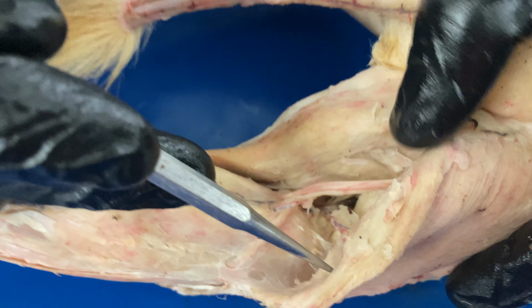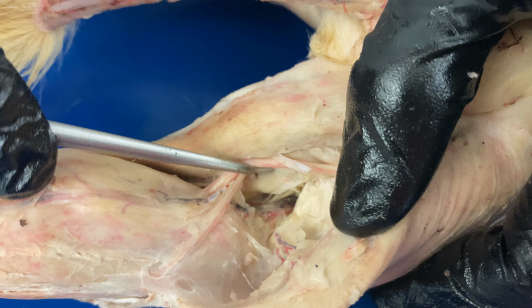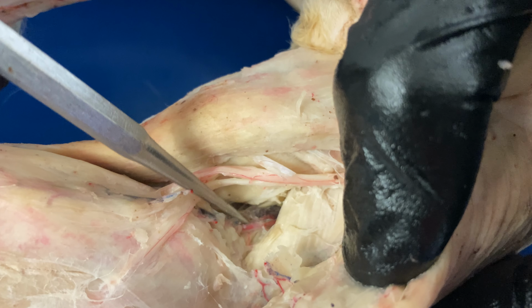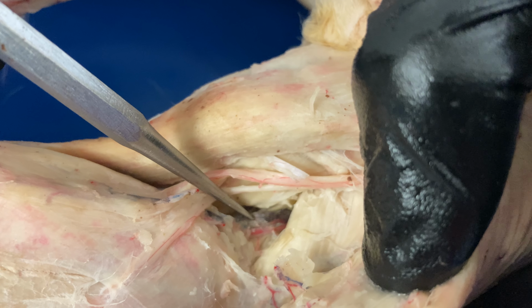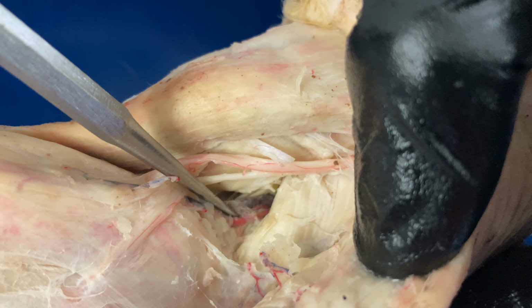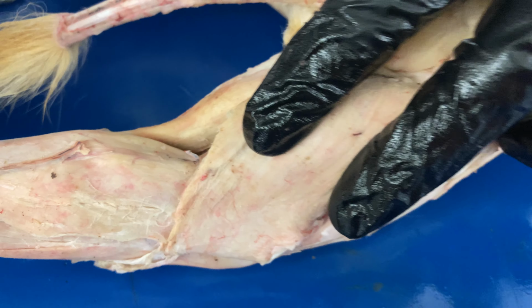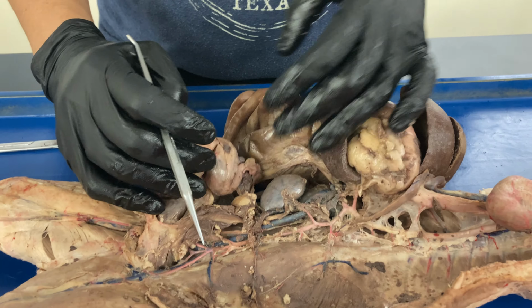Okay, so this is the back of the knee. This is that sciatic nerve that you learned in the last practical, but if you can see right here, back behind the knee, those would be your popliteal artery and your popliteal vein. Blue would be the vein, red would be the popliteal artery, and then they're going to go down and branch into the vessels of the leg. Okay. So let me go back up here.